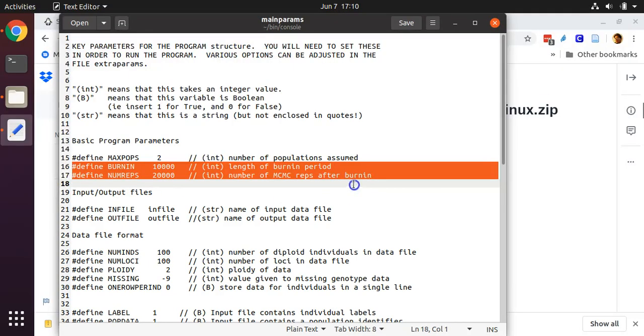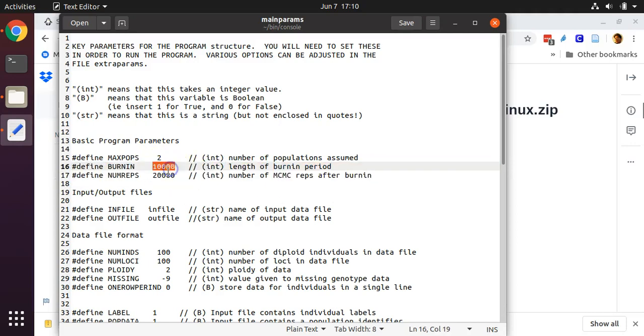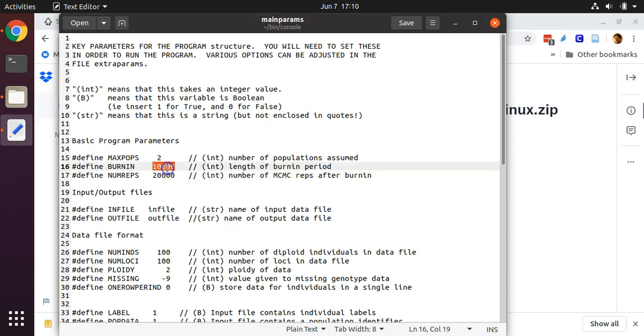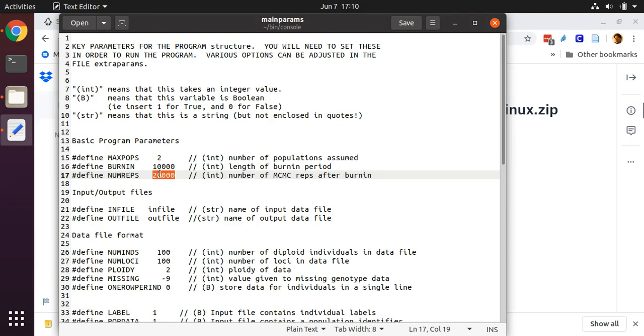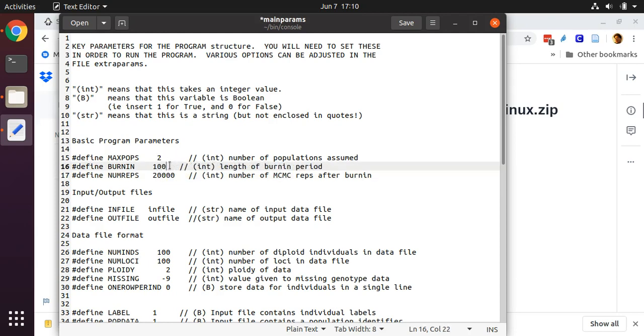Don't worry about this setting here for defining the number of k clusters. This setting will be overwritten later on when we add some extra commands in the terminal window. It's important, though, to set these two parameters appropriately: the burn-in and then the number of runs after the burn-in. Typically, you want your burn-in period to be 10,000, 100,000, or even a million. You want your number of runs after the burn-in period to be 100,000, a million, or even 10 million. For the purposes of this tutorial, we're going to set these numbers far lower.